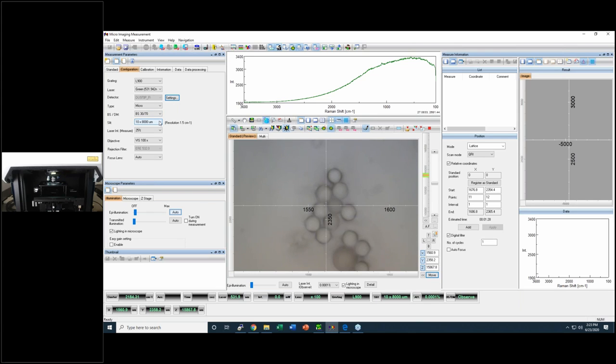The slit, if I click on this slit, we can see seven different slits. The smaller ones are the pinholes, which come in a circular shape, and there are four others that come in a rectangular shape, for example 50 by 800 micrometers. This type of slit allows more signal to pass to the detector, and that is the signal that goes to the grating.